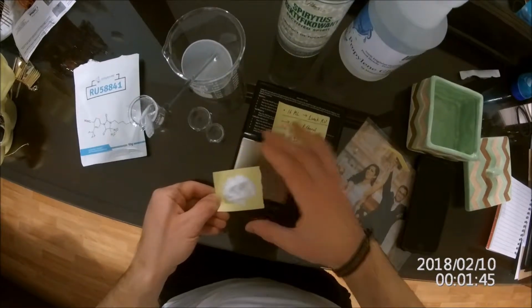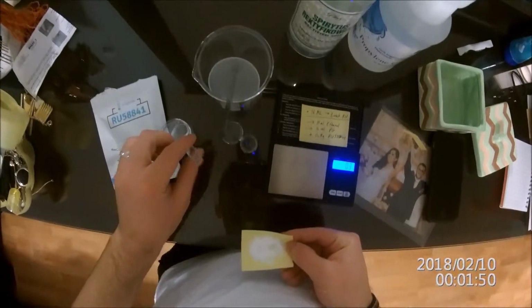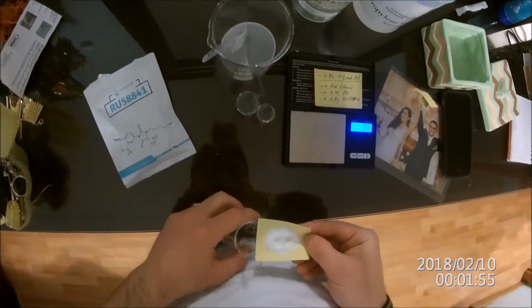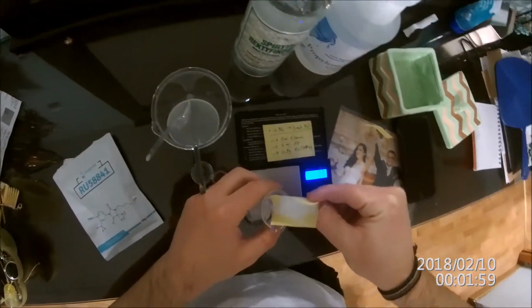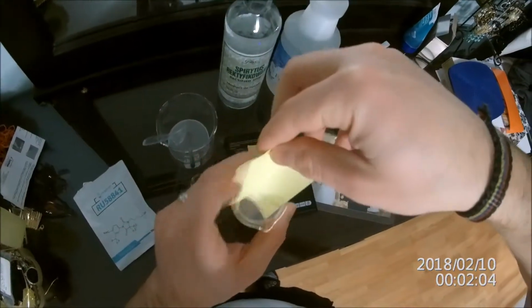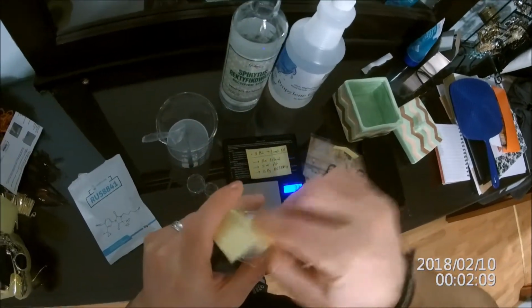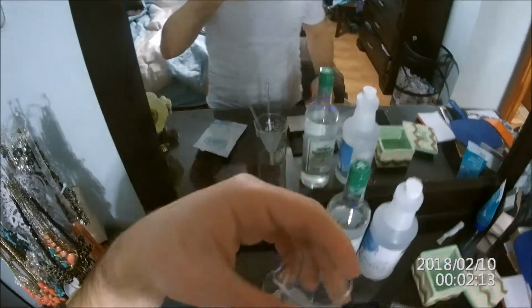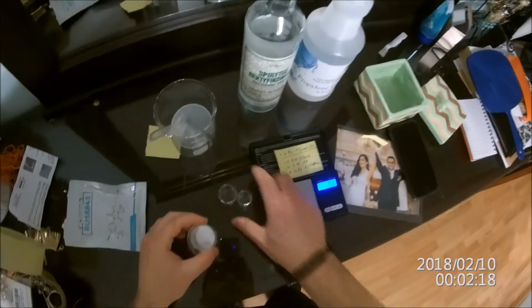Oh jeez. I'm going to spill it, aren't I? If I can manage to put this in this small beaker where I do the mixing, then I'm good. So carefully I'm going to put this here, and there we go. I don't want to waste any of this at all. Here it is. It's inside the beaker. Now what we want to do is first put the ethanol.